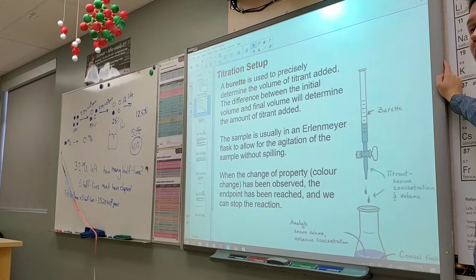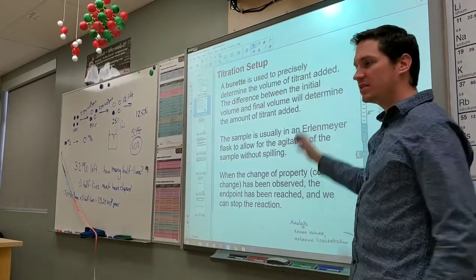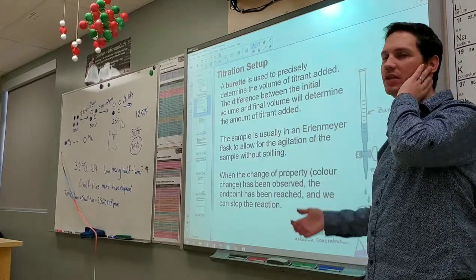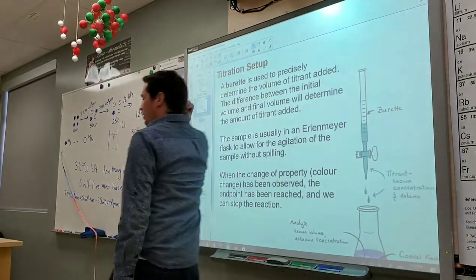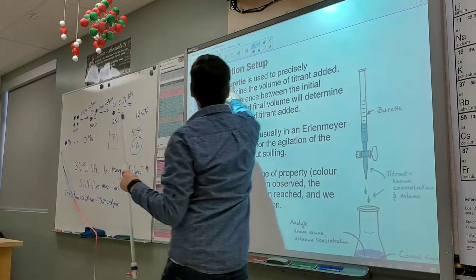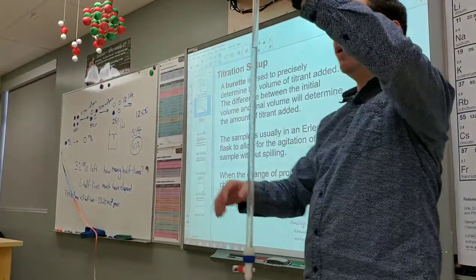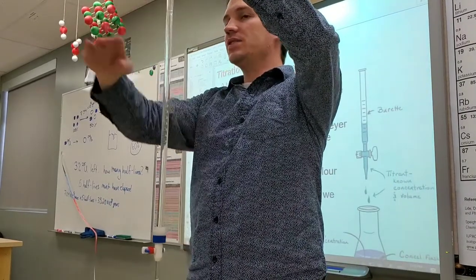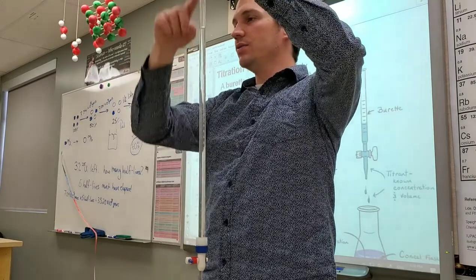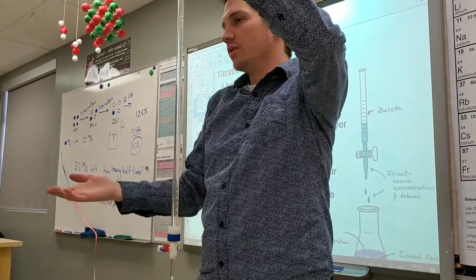I want to say a couple things. This is a hypothetical. This is what would happen in the lab, but I want to give you some tips and tricks about what you actually need to do in the lab. Now, let's think about this. I've got my burette, right? A burette is used to precisely determine the volume of titrant added. You want to know where I started and where I stopped. I just need to take the difference in those values, and that'll give me the volume that was added to the sample. Would you agree with that?